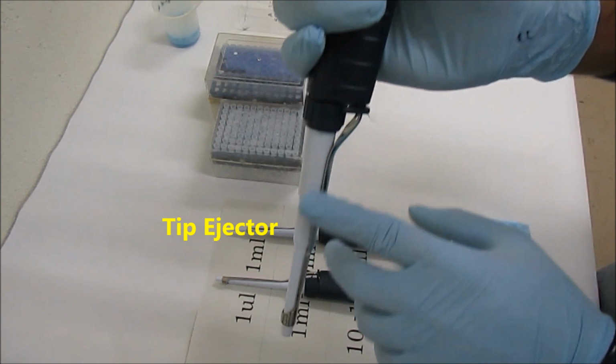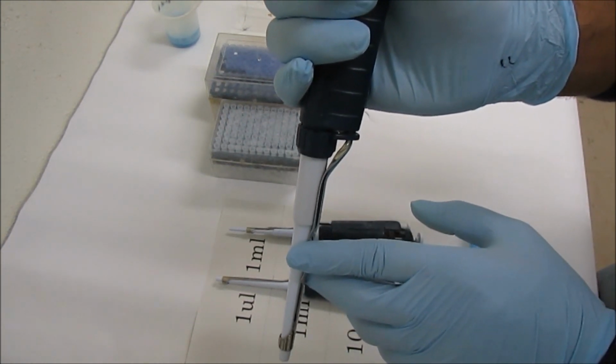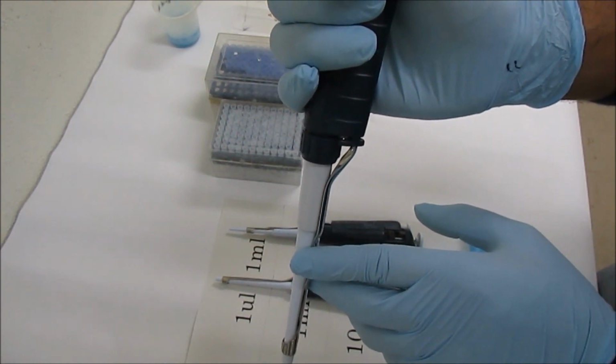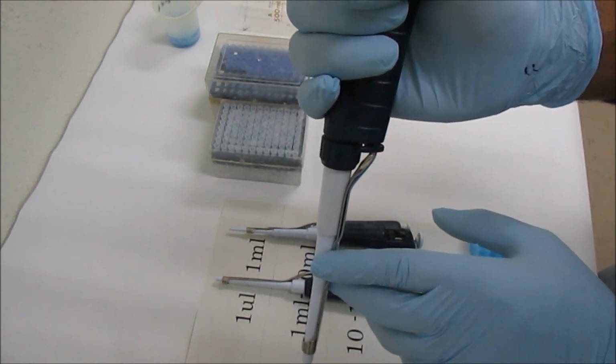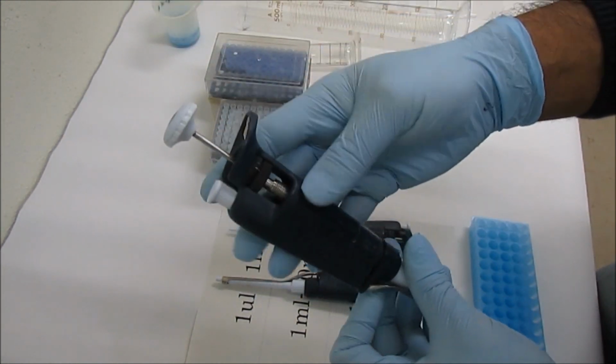And this is the ejector, which is used to eject the tips. Every time you measure a different volume or different liquids, you need to replace the tips. So these are the parts of the pipettes.